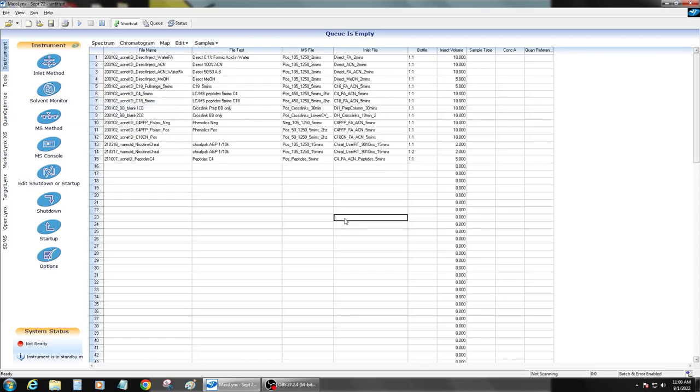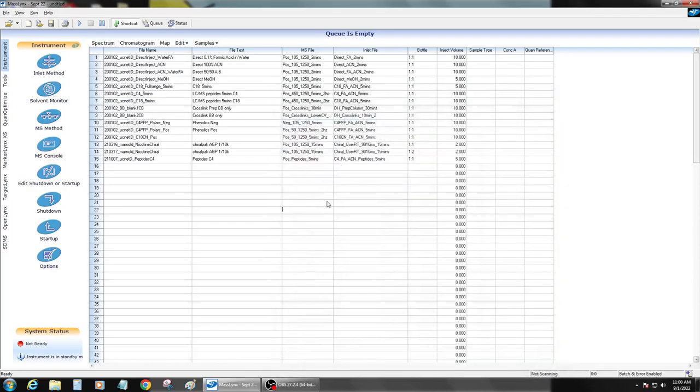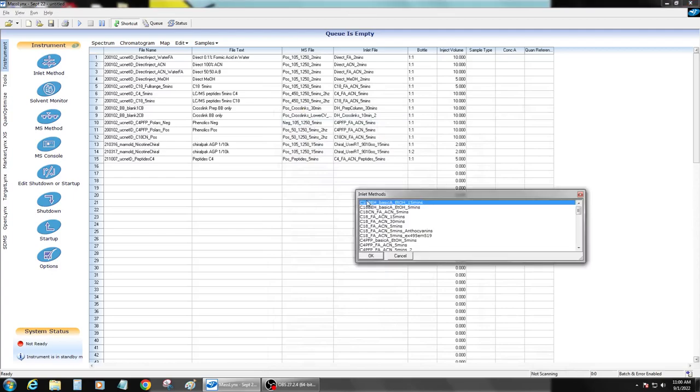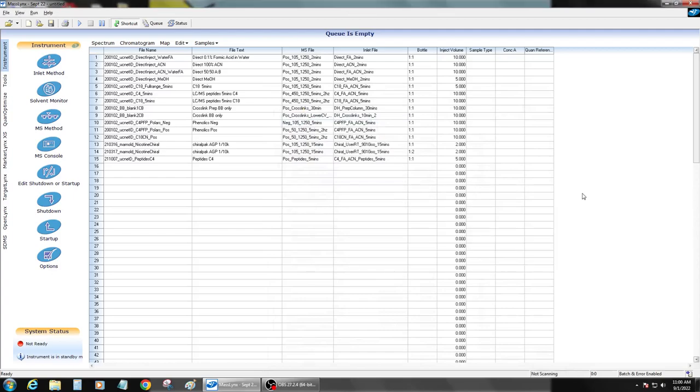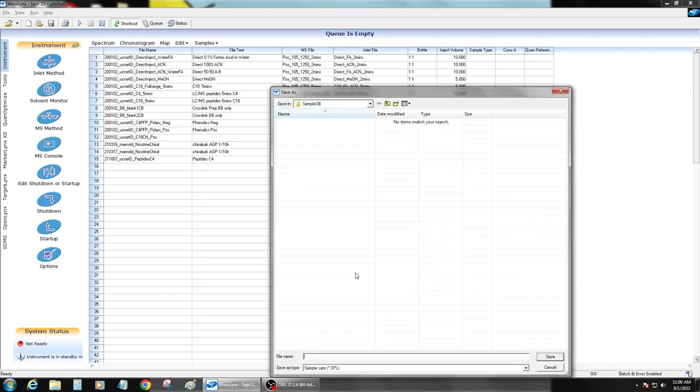And then you can see in here, I have all my methods for everything saved. And then you want to make sure the last thing you do is save it as a sample list.